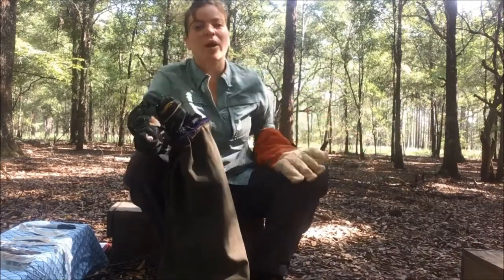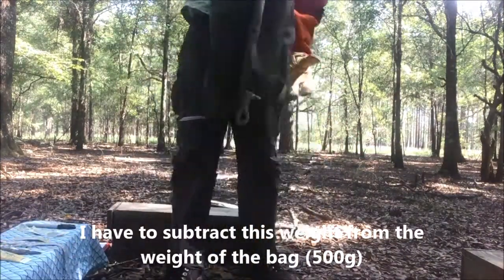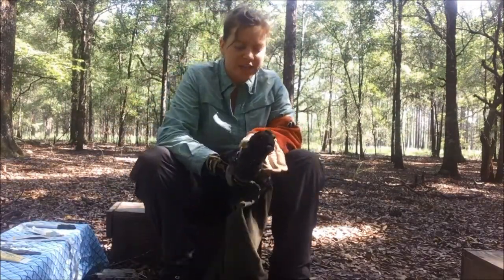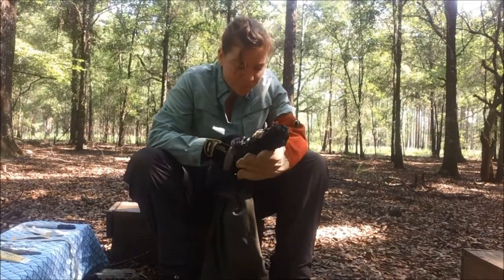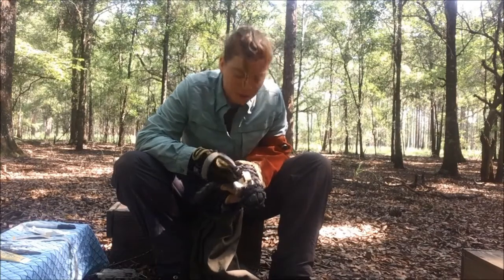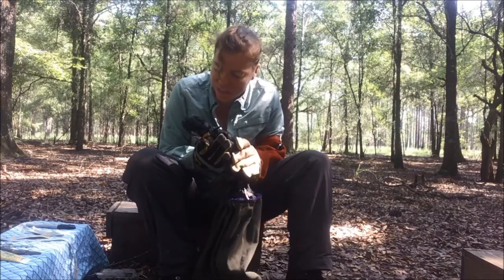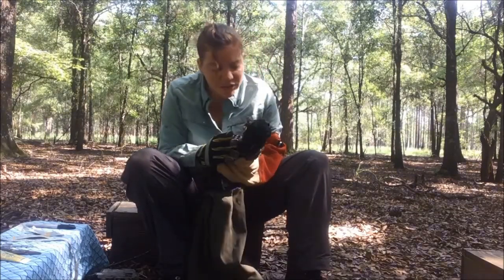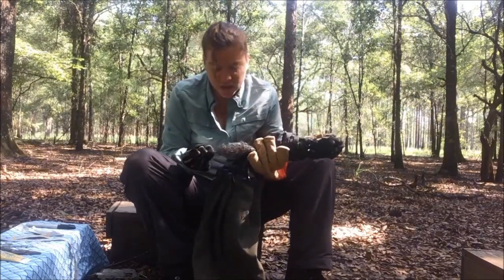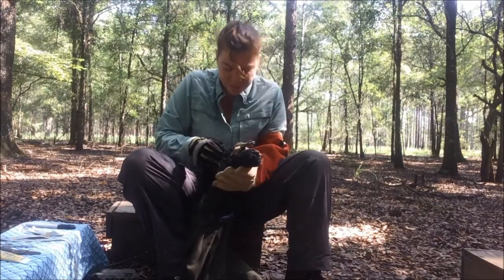First things first, we're going to get a weight on him. The next thing I'm going to do is try to get a sex — looking at his reproductive organs, he is a scrotal male. I'm generally taking a look at his condition, checking for parasites, and this animal is actually in very good condition. He has a nice full tail. I'm going to take his back foot out to measure it.